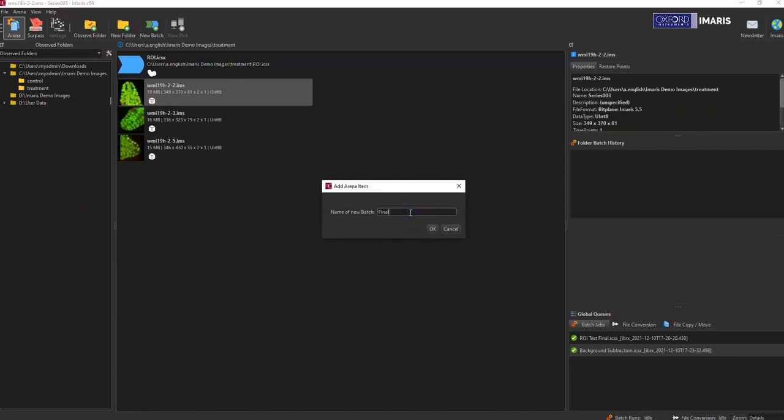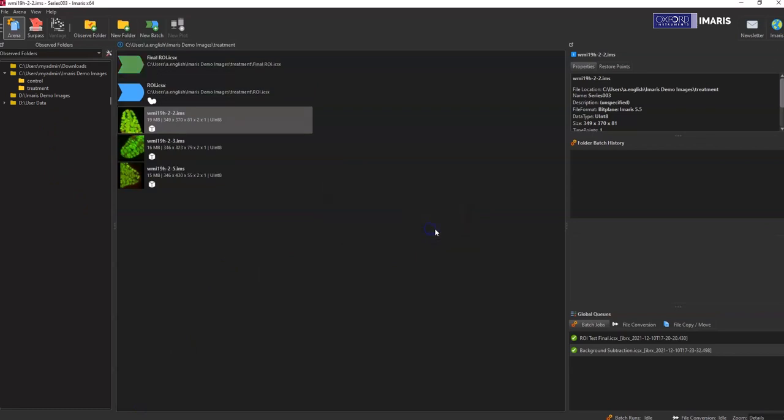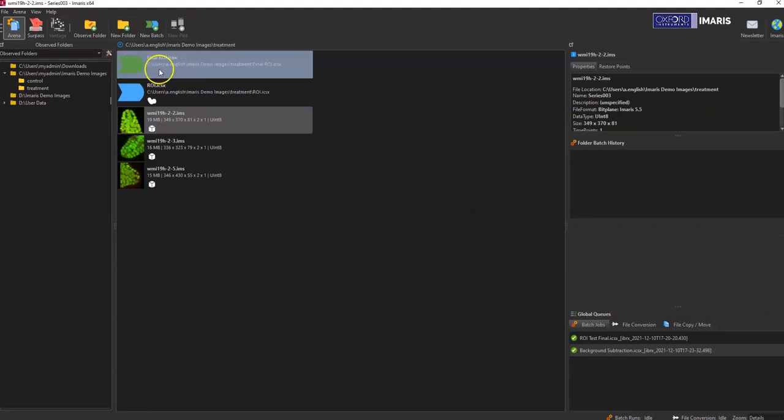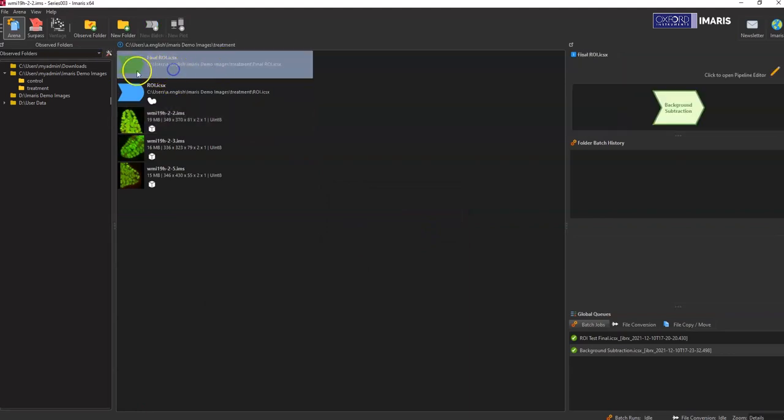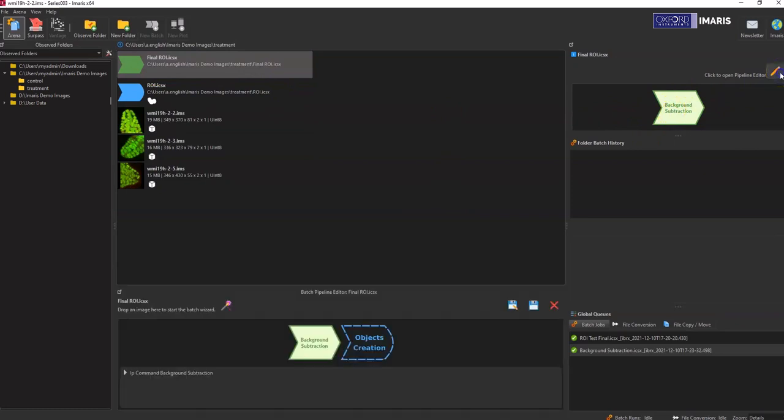And then we'll name this final ROI. Right now this final ROI batch, you can see it only has a background subtraction filter in it. So we need to add in the ROI part that we're interested in.